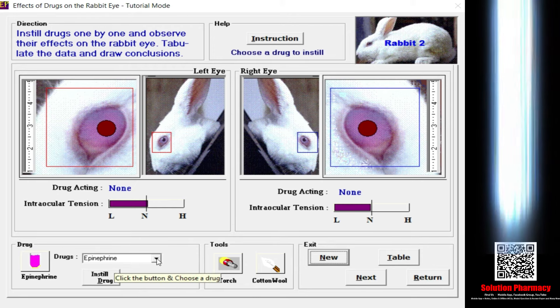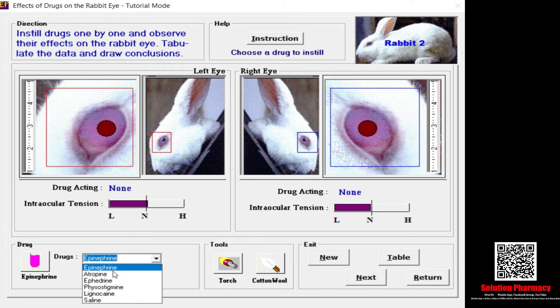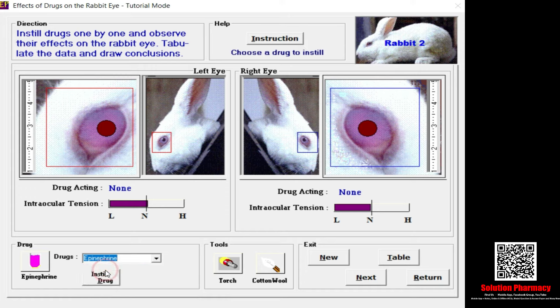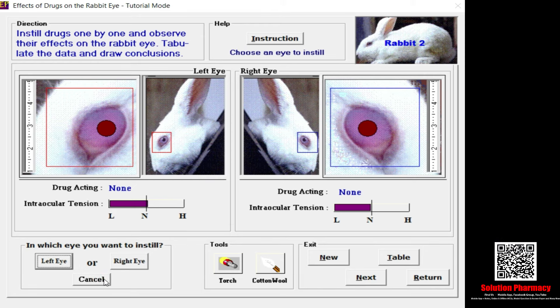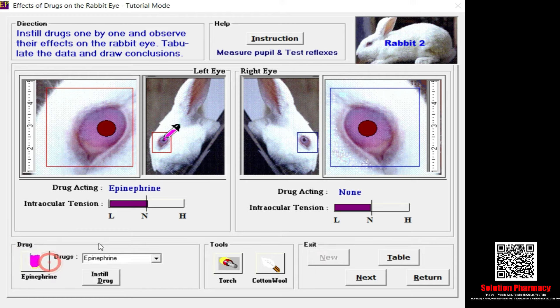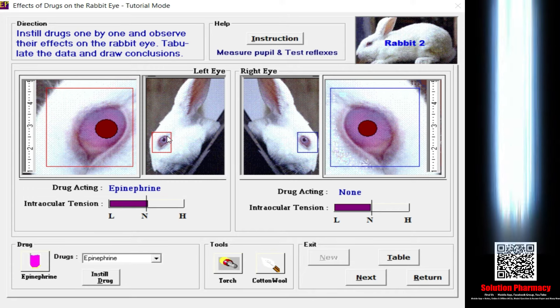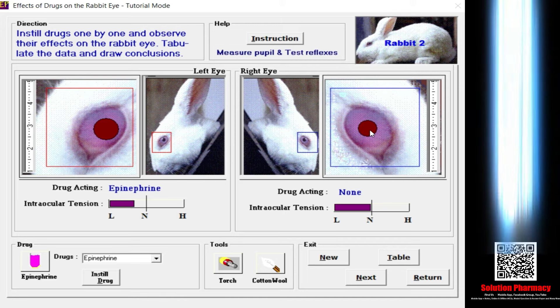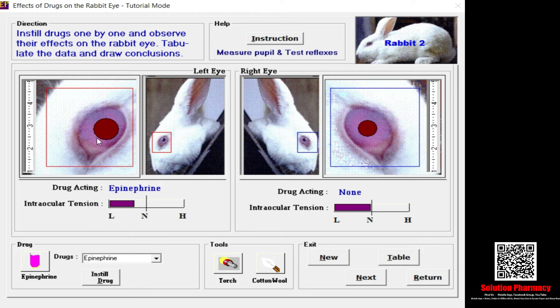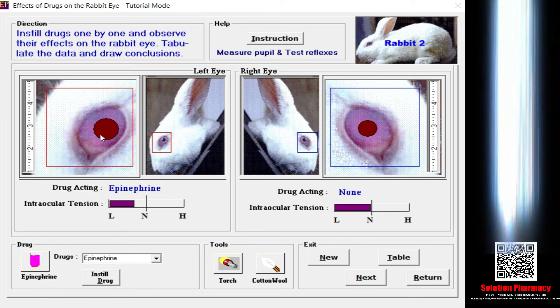Now I am going to select a drug. I have clicked the dropdown arrow and selected epinephrine. You need to instill the drug using the instill button. It asks which eye — I am selecting the left eye. After clicking, the drug is instilled and you can see the changes in the diameter of the pupil. The initial right eye is in normal condition, but after placing epinephrine the diameter of the pupil increases — this is called mydriasis. This is the effect of epinephrine.